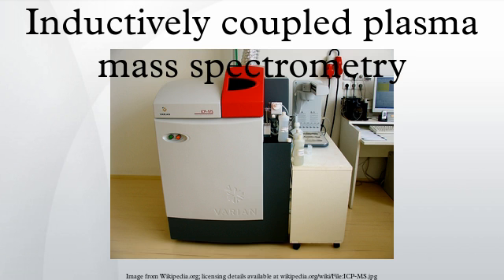After the sample is injected, the plasma's extreme temperature causes the sample to separate into individual atoms. Next, the plasma ionizes these atoms so that they can be detected by the mass spectrometer. An inductively coupled plasma for spectrometry is sustained in a torch that consists of 3 concentric tubes, usually made of quartz. The end of this torch is placed inside an induction coil supplied with a radio frequency electric current.